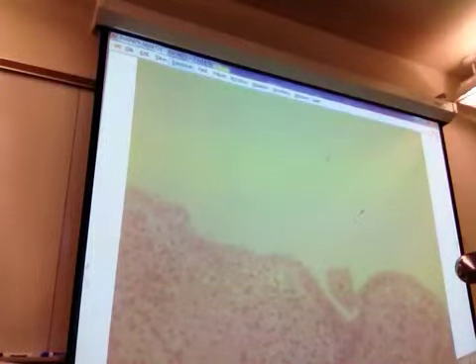Hold on. I might have spoken too soon because it might be in the fallopian tube that it's simple columnar. It's not transitional because transitional is only in the renal system. Let's find it.